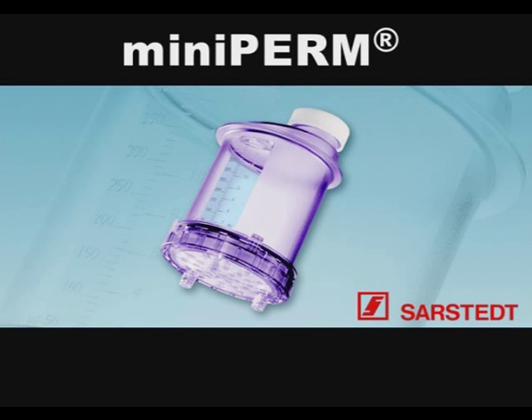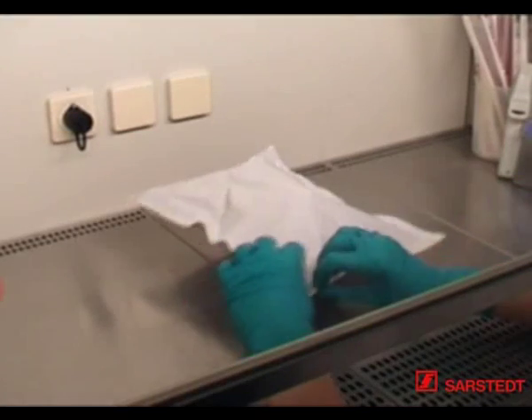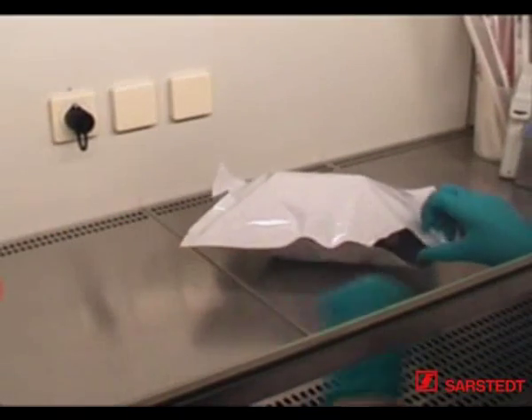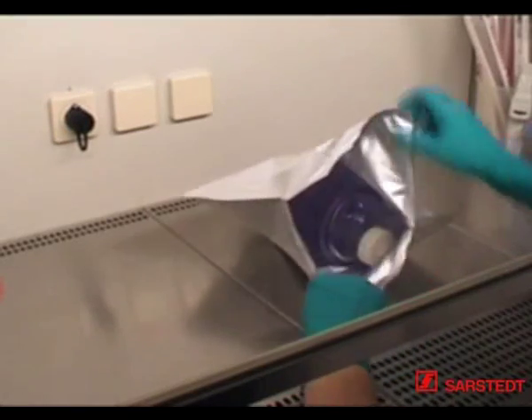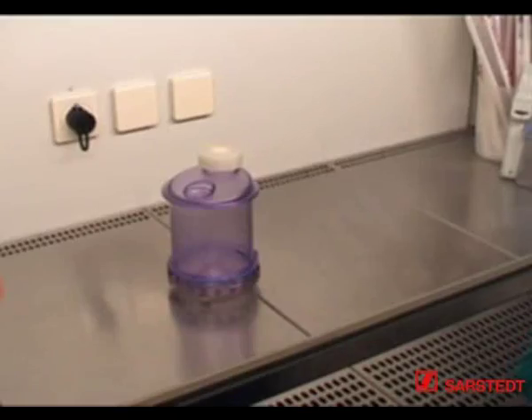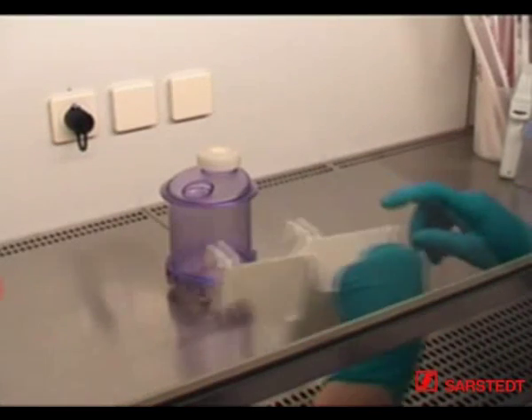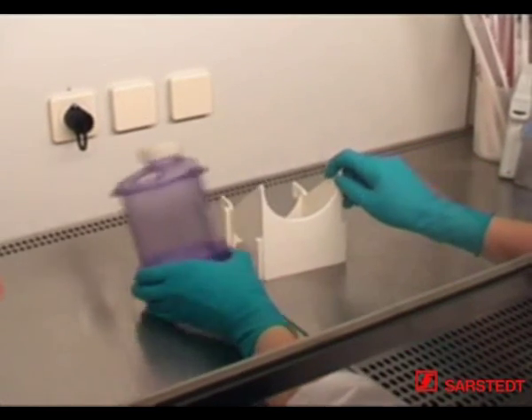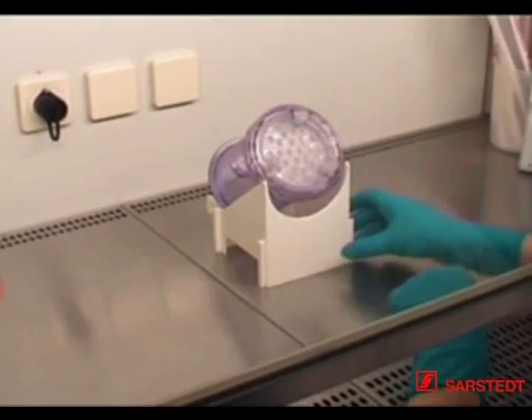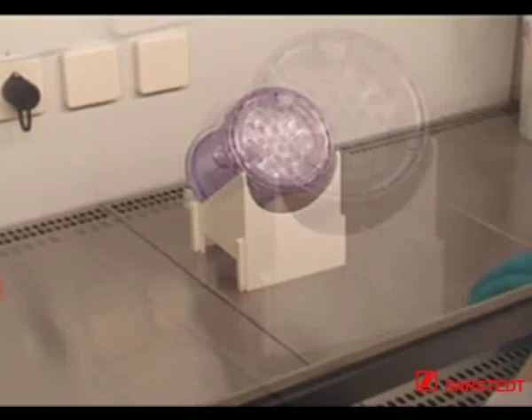MINI PERM, the bioreactor for protein production. The following components are required to start a cell culture in the MINI PERM bioreactor: a MINI PERM bioreactor, already assembled as shown here or as a reusable option, and a compatible rack to accommodate the bioreactor, freely rotatable and complete with the production module on top.